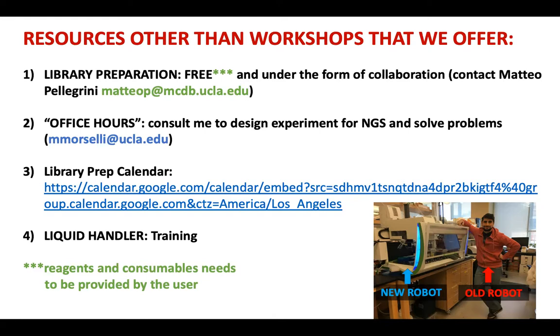We also have a sonicator that you are welcome to use if you want to fragment your samples. It's a Bioruptor Pico. The only thing you have to buy is the tubes, and that's it. Again, if you want to use it, just send me an email. I'll add you to the Google Calendar that we have, so you can just schedule your time, and that's it.